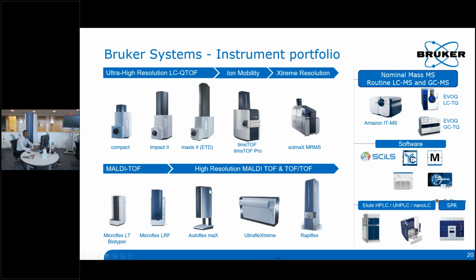Also, not to forget that although we looked at MALDI today, we have a large portfolio of other instruments as well, from high resolution LC-Q-TOFs to ion mobility instruments, and also routine LCMS and GCMS instruments that you have available from Bruker, all supported with industry standard software and other add-ons as well that you can get from Bruker.